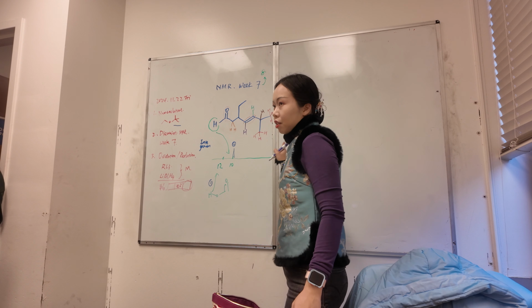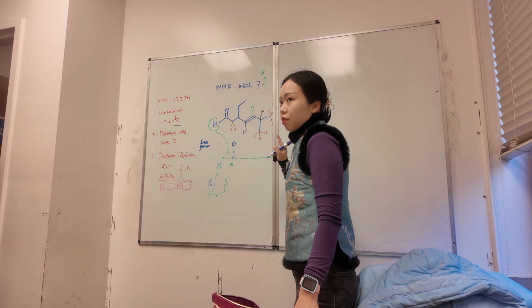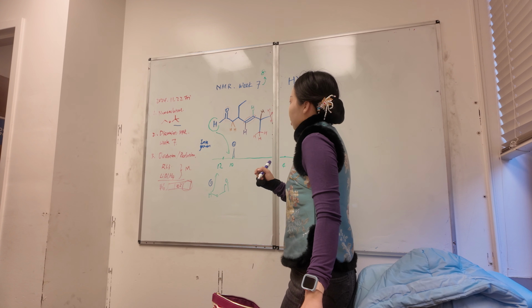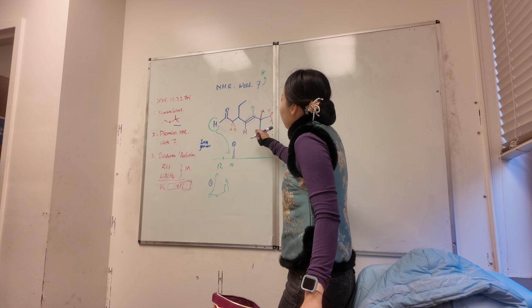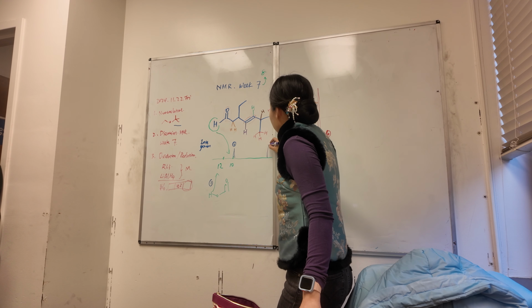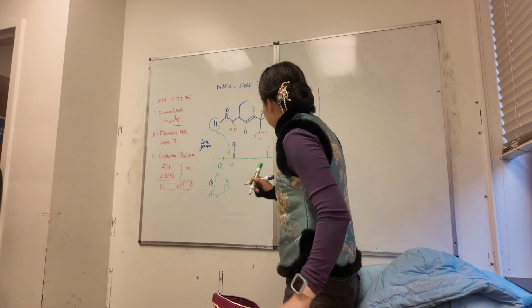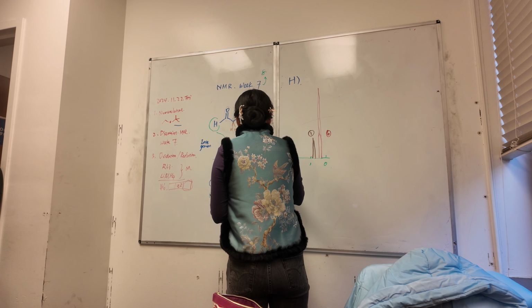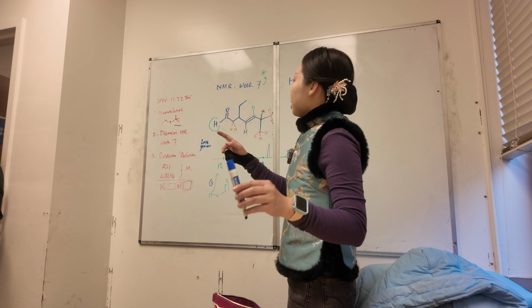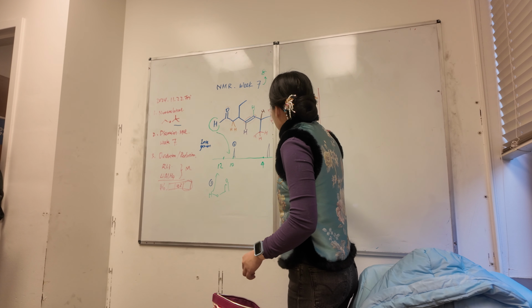That's why your note card writes down that number, but it's not really going to help you because these exist everywhere. What you should rely on is what is next to it. You should know there should be something around here. It's cut off, so let me put 4 this way. So 2 to 4. It's not cut off because there is a lot going on here. You should know where those peaks will be before we actually start to talk about splitting. You should know they will be roughly higher.